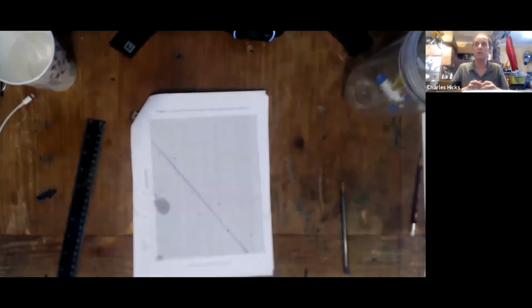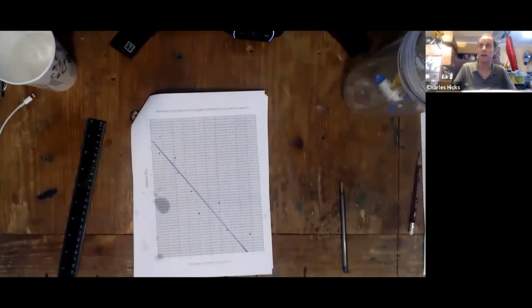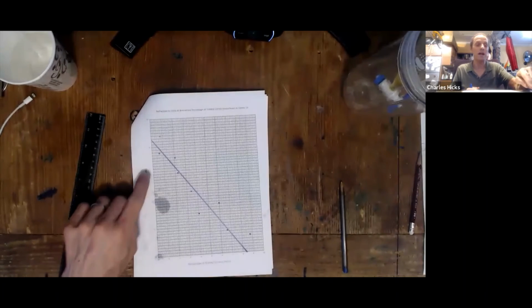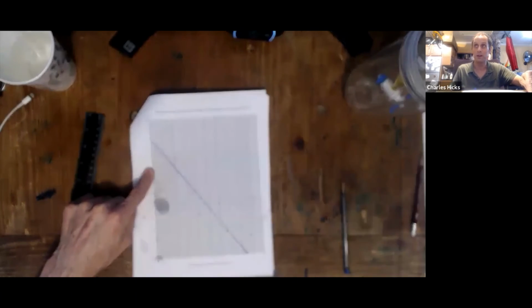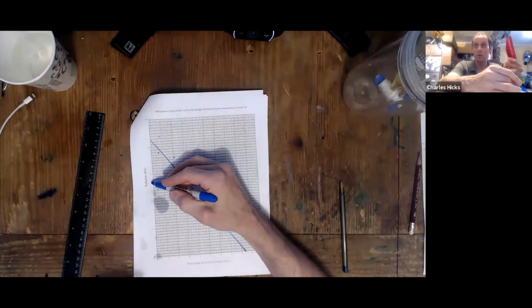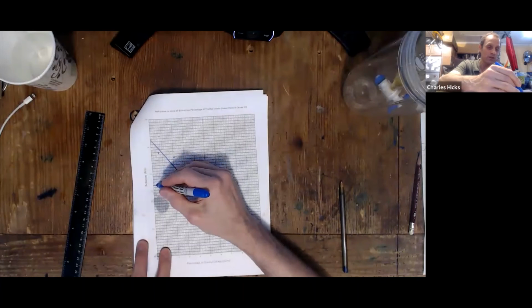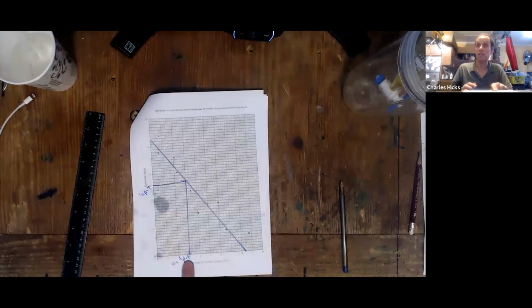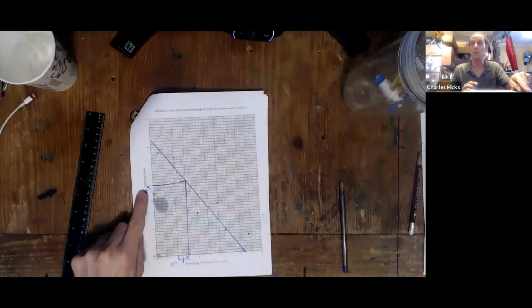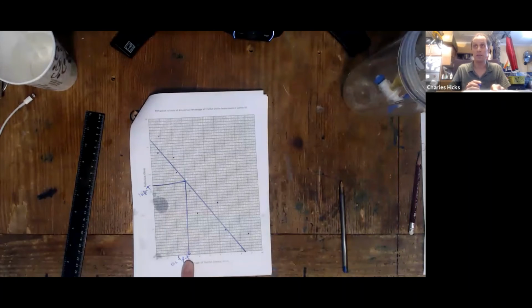And both of these graphs we'll be using as calibration curves, which means we'll be using them to figure out outputs from inputs. The inputs will be refractions that we measure in the very end of the experiment for equilibrated oil, water, and triethyl citrate. The way we'll do it is we'll look for a refraction value that we measured on the y-axis for the sample of oil or water, and we'll go across until we hit the curve, and then use a ruler to make a nice 90-degree turn and go down. The value that we read here from this output would be the percentage of triethyl citrate by mass that goes along with that refraction that we measured. So if we measure that refraction, we can figure out the percentage of triethyl citrate in that solution.